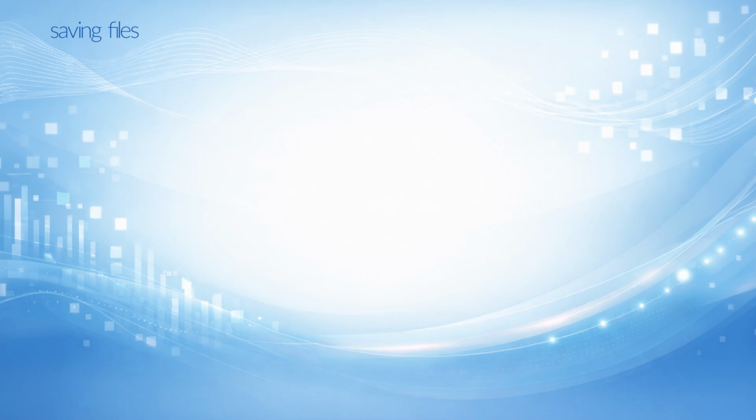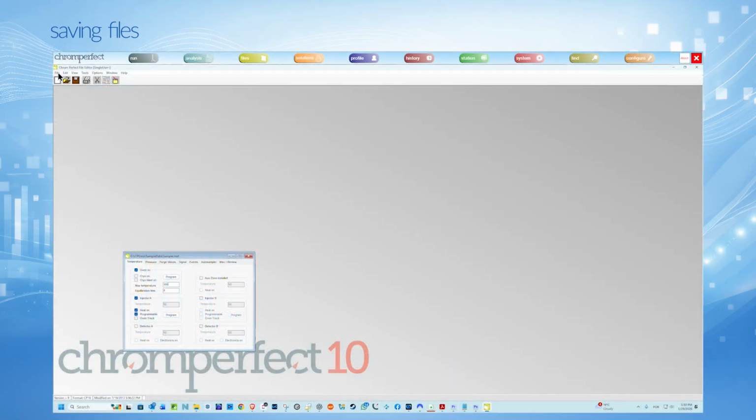Saving files. To save changes to the same file, choose File, Save. The active form's contents are written to the current file, and the version number is incremented. No warning is given because overwriting the original file is assumed to be intentional. The form remains open for further editing. If the file was opened as read-only, the Save option is dimmed. If the file has never been saved to disk, Save behaves like Save As.